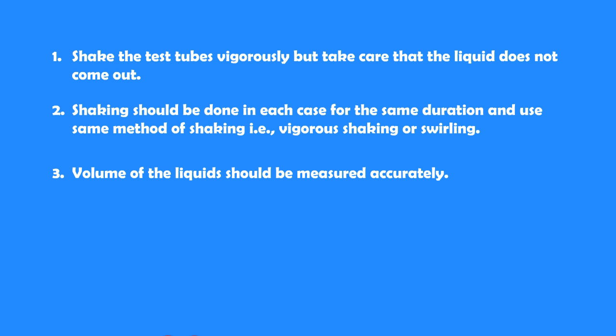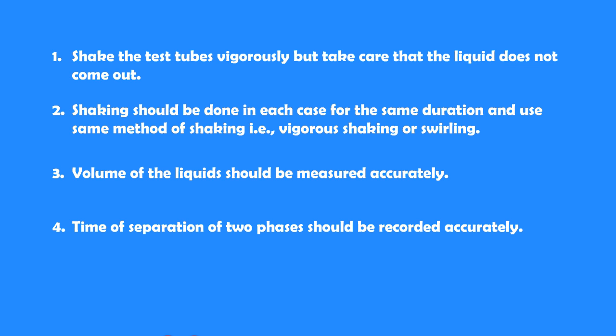Volume of the liquids should be measured accurately. Time of separation of 2 phases should be recorded accurately. Start the stopwatch immediately after shaking.